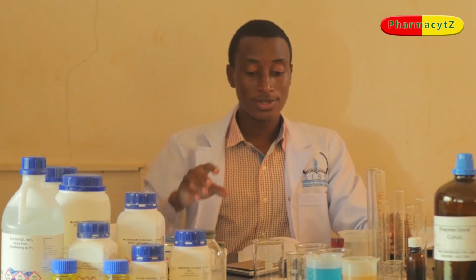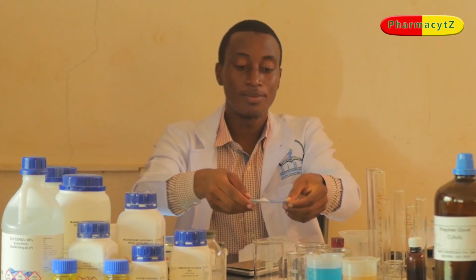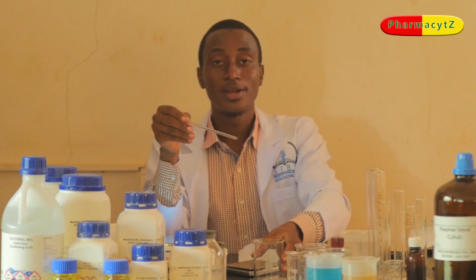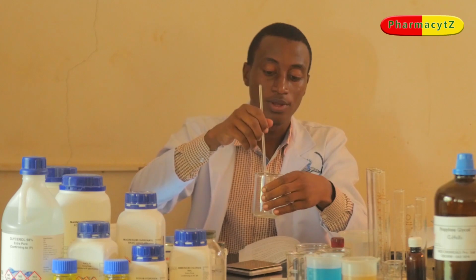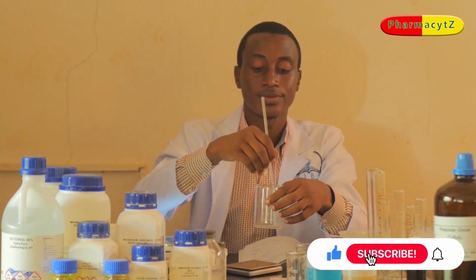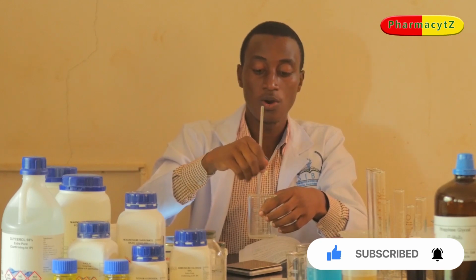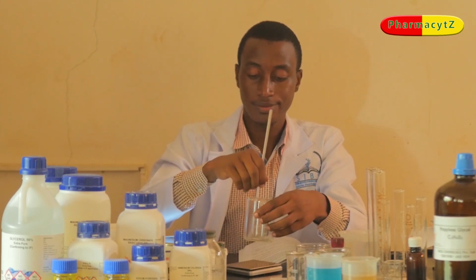So after putting 2 mL of purified water in the measuring cylinder, then dissolve 2 grams of potassium iodide in this amount of water. As I said before, the ratio is 1:1, so 2 grams are going to dissolve in 2 mL of purified water. You stir gently until the whole amount of potassium iodide dissolves. So it has already dissolved, as you can see.